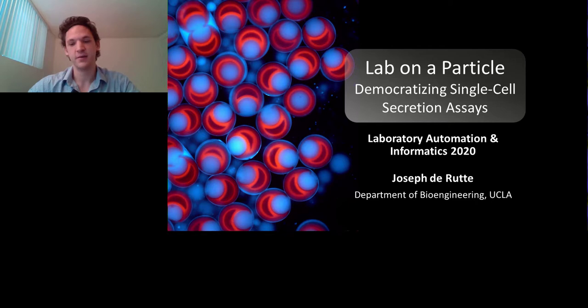And I always like to start my talk with the fluorescence image that you see on the screen right here. So this is a fluorescence image of sub-nanoliter droplets formed using only a pipette and microparticles. The objective of my talk is to convince you, the audience, that using this lab on a particle technology, you can enable really any researcher to perform single cell secretion assays.